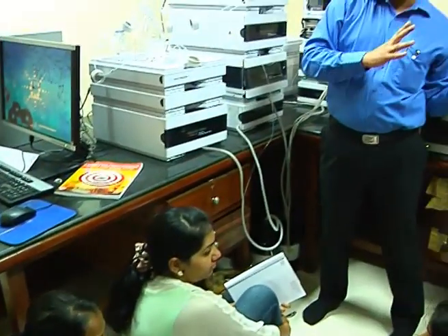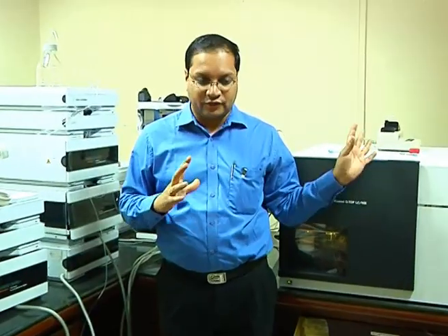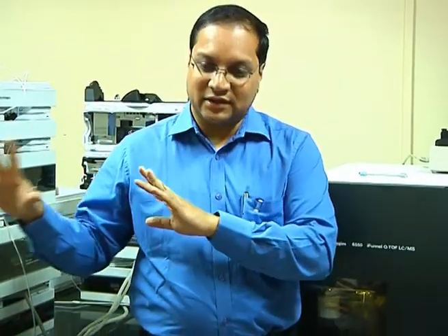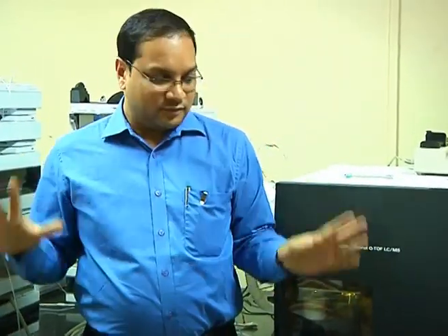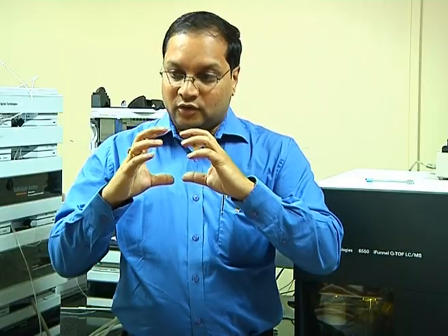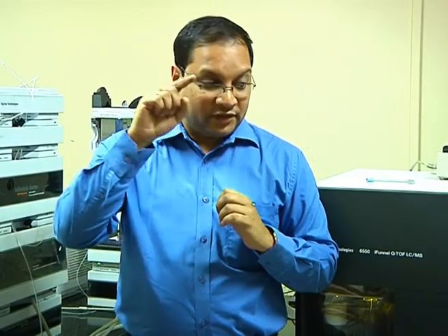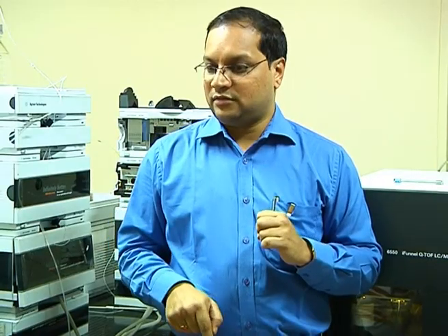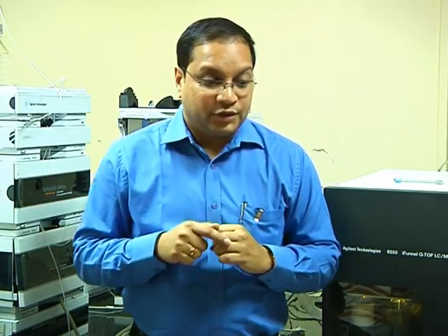Let us understand in general first the functionality, why we use this, and then the applicability. These are very specific questions because you have experience, that's why you are asking. I could sense some experience, but most of you may not have experience. But at least you should know what exactly the quadrupole is doing. So quadrupole is a filter, a mass filter. It's very specific because of that. It is selective, hence sensitive. That's why it is used for targeted analysis.